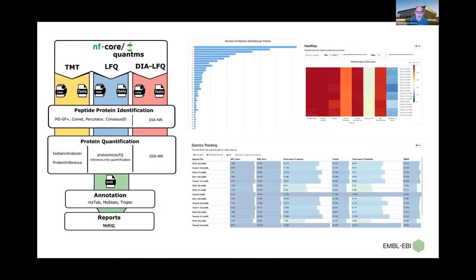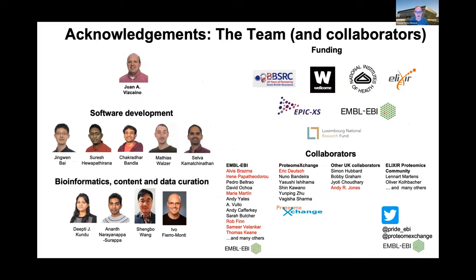And secondly, I want to mention that it's increasingly important to provide and develop cloud infrastructures and pipelines that enable users to reanalyze data in large-scale environments. We have developed something called quantms that people can start using, and we are using it actively within the team. This is the team led by Juan Antonio Vizcaíno, and thanks to all the submitters of ProteomeXchange and PRIDE in particular.